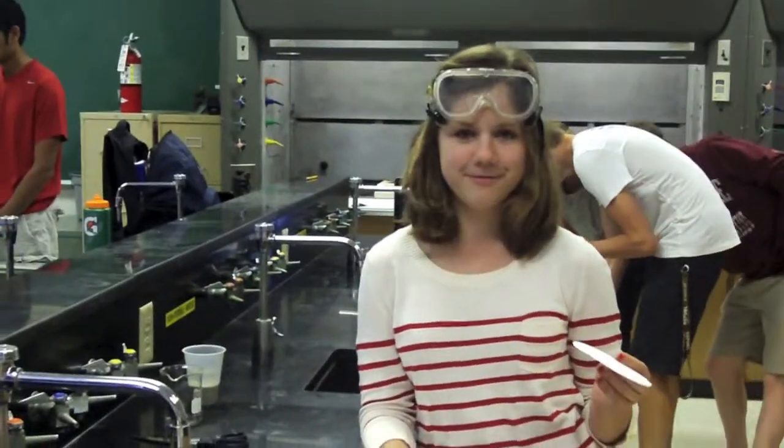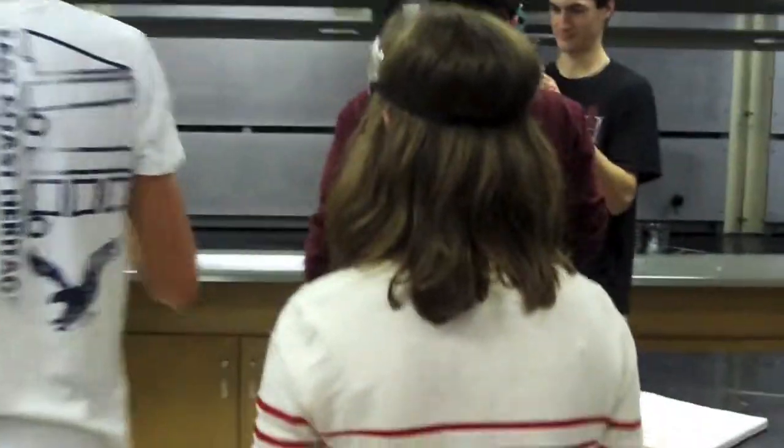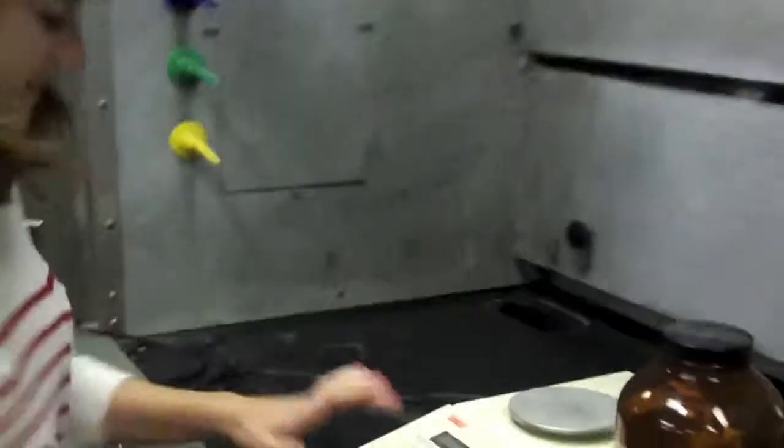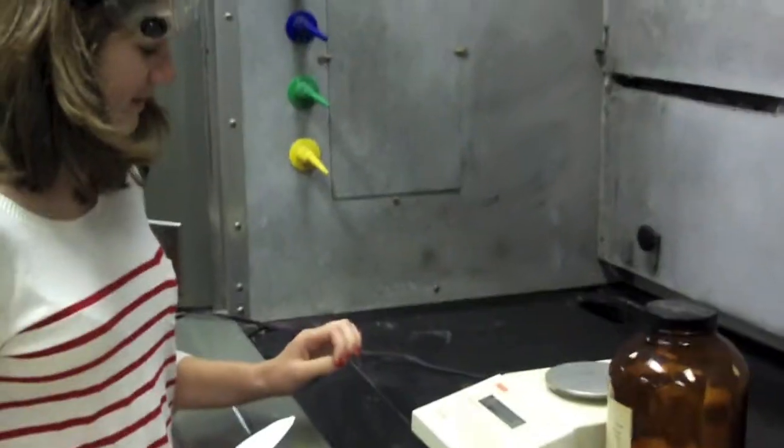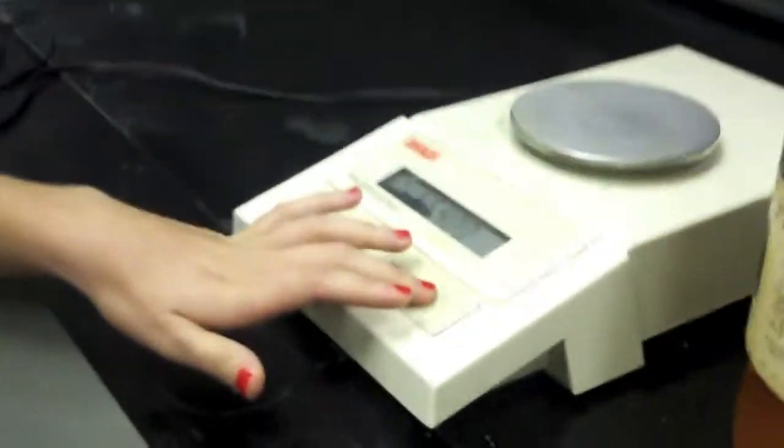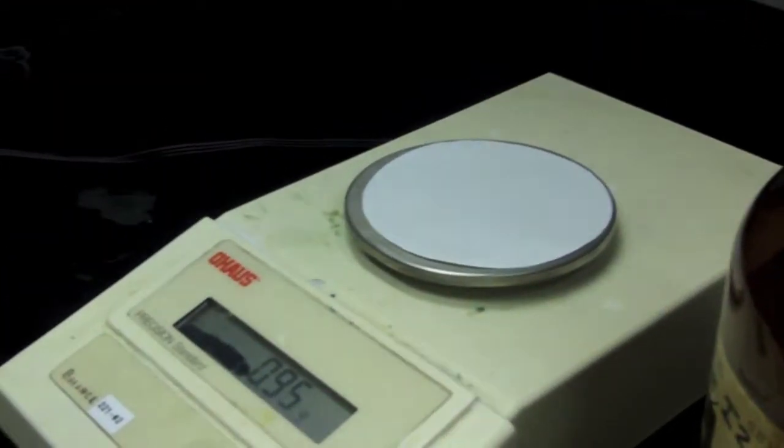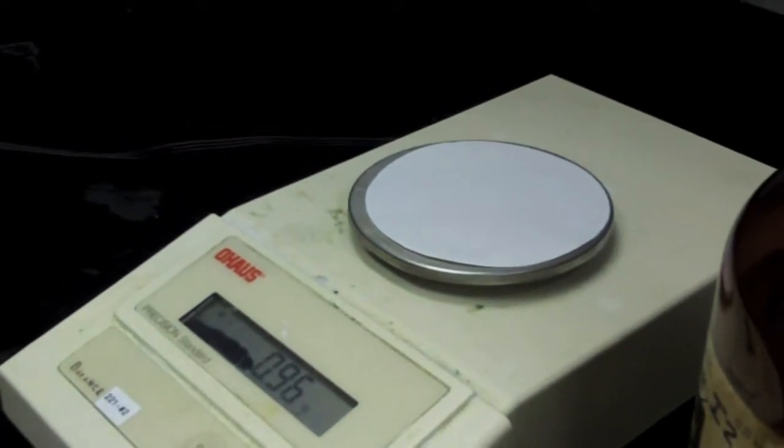The first thing you should do is tear the filter paper and weigh it so that you know the weight of the solid plus the paper. So we'll go over to the scale. Turn on the scale and make sure it says zero. Place the filter paper on and record the weight of it, which is 0.96 grams.